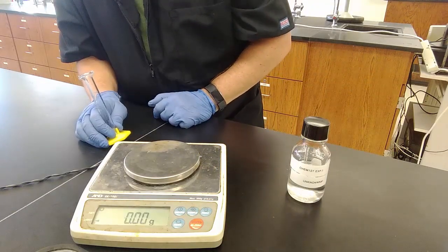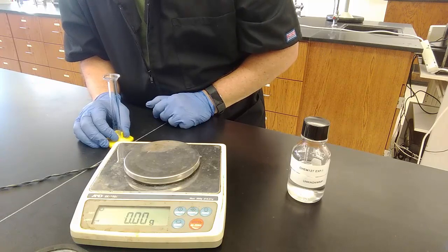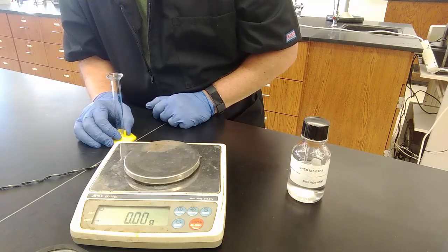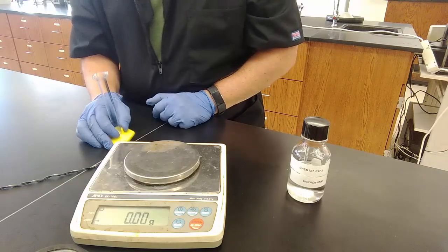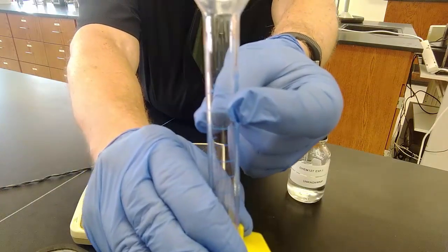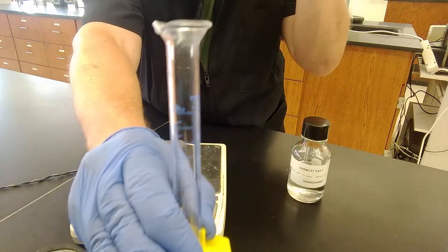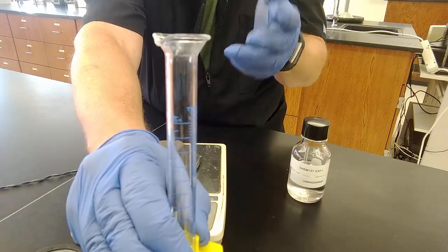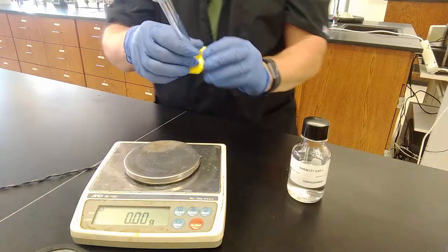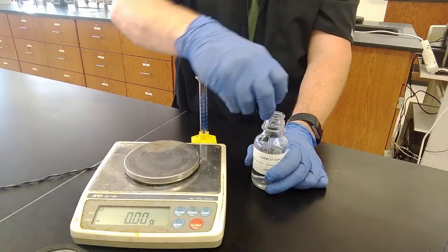So it says use a funnel to carefully place approximately 10 milliliters of the unknown into the graduated cylinder and weigh it with the liquid. Between 8 milliliters and 10 milliliters is fine, but I definitely can't go over 10, because if I go past the 10 line, there's no more lines, and you can't get a reading. So somewhere between 8 and 10 milliliters, so that I have enough in there to get a significant mass.